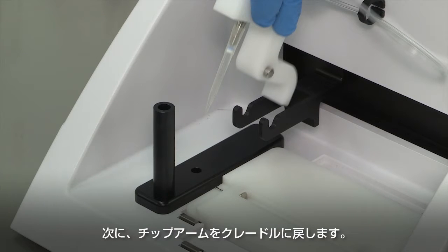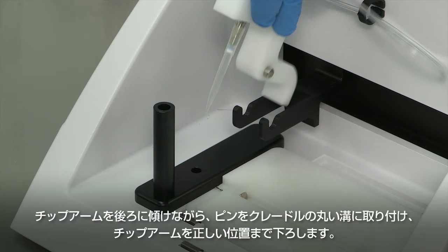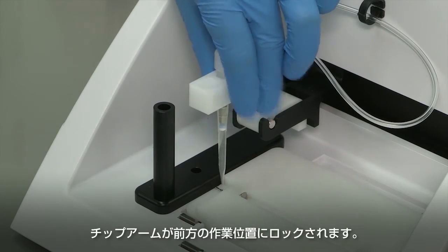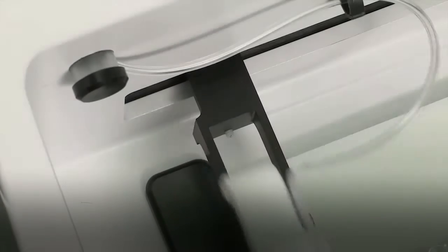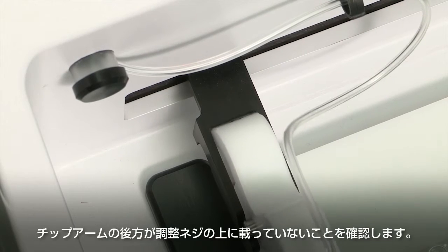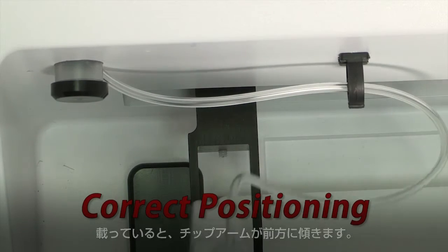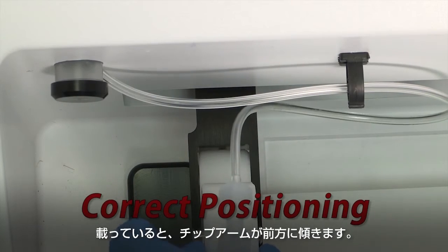Return the tip arm to the cradle. Tilt the tip arm back, align the pins with the round notches in the cradle, then lower the tip arm into position. Rock the tip arm forward into the working position. Ensure that the back bottom end of the tip arm is not resting on the top of the thumb screw, which causes the tip arm to tilt forward.